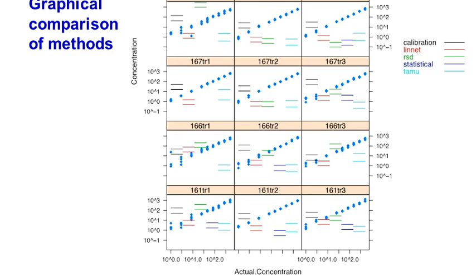The panel here shows each row of 3 as one peptide. 169 is the number given to a specific peptide, and you have transition 1, transition 2, transition 3. So we have 4 peptides here, and we are looking at 3 transitions per peptide.